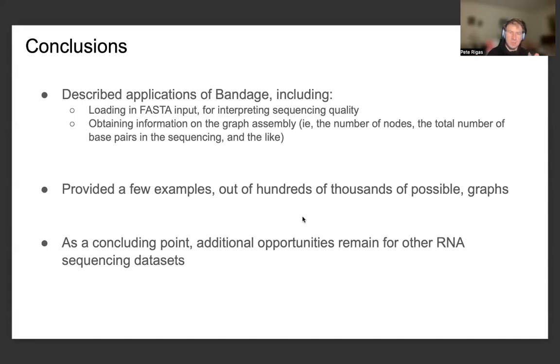But this is a rather idealistic case, because as we can see in many cases, there are graphs which consist of nodes, many of which have degree greater than 1, or can even have degree 3, 4, or 5, as we demonstrated in the graph example which has an inner cluster approximately near the middle of the graph, which can indicate to us different types of uncertainty that we can expect when comparing sequences that are generated from a transcriptome assembly.